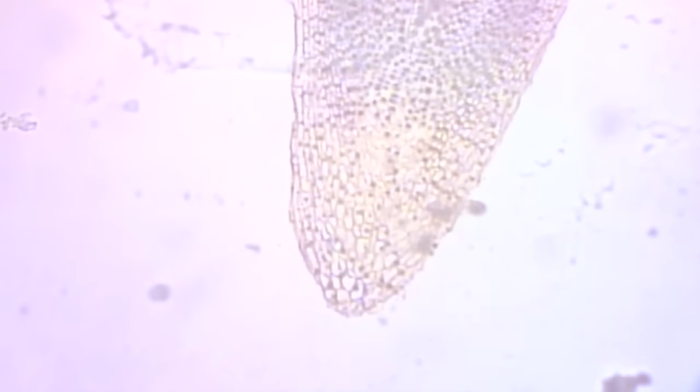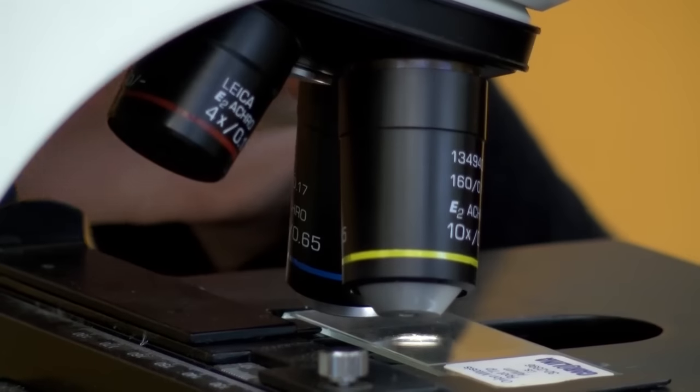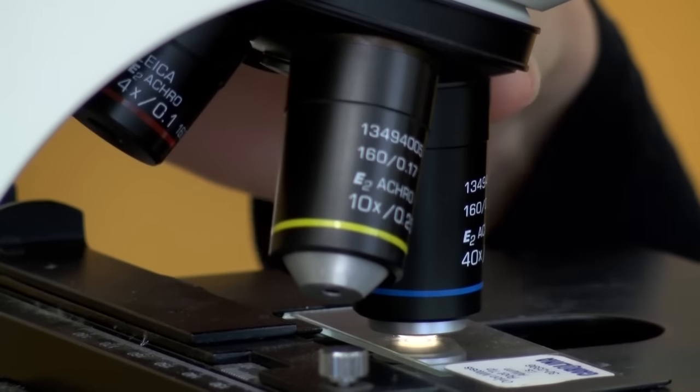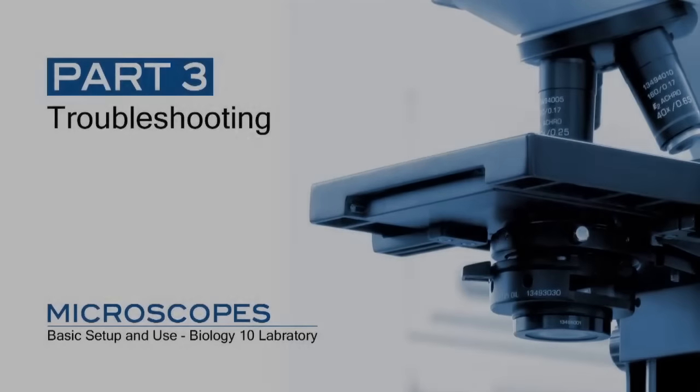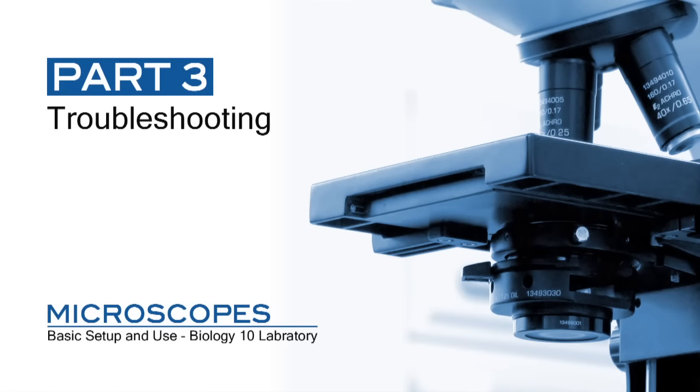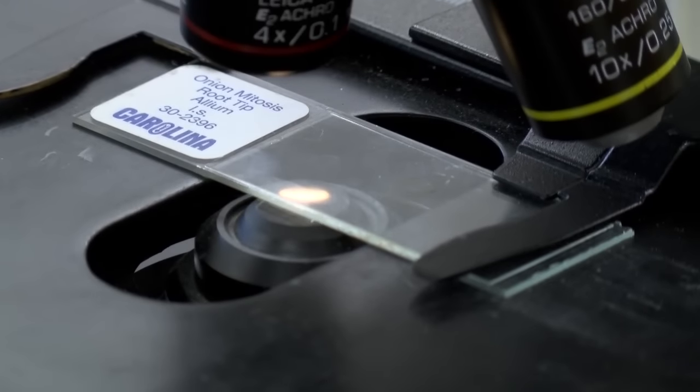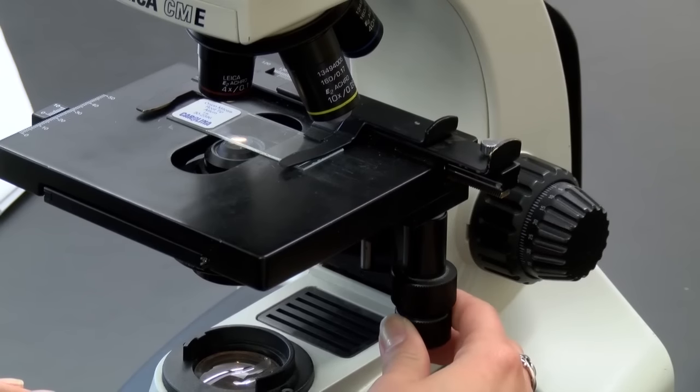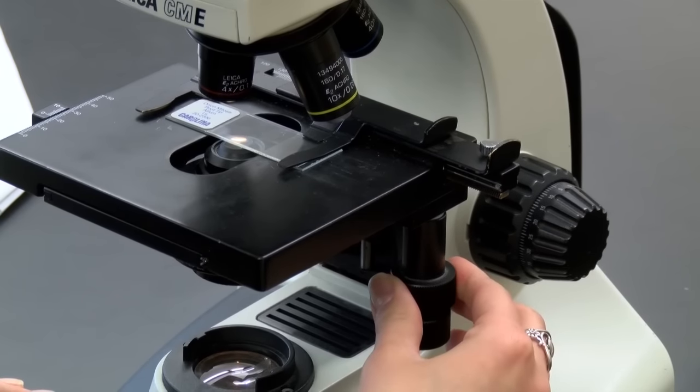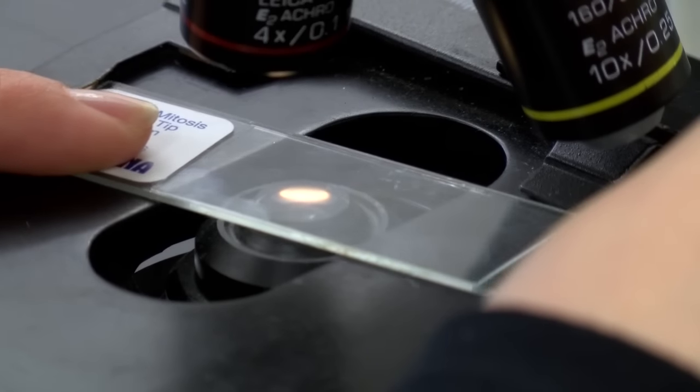Again center the specimen and you are ready to move to the highest power lens, 40X. If your slide doesn't move when you turn the knobs to adjust the slide holder, make sure you are using the right knobs and that the slide is clipped in place properly.